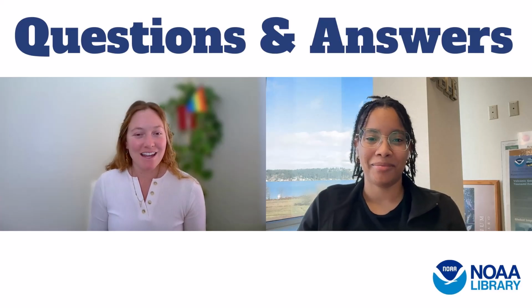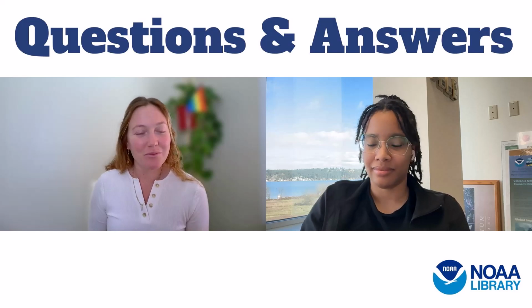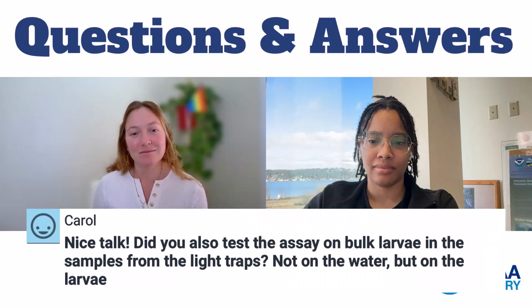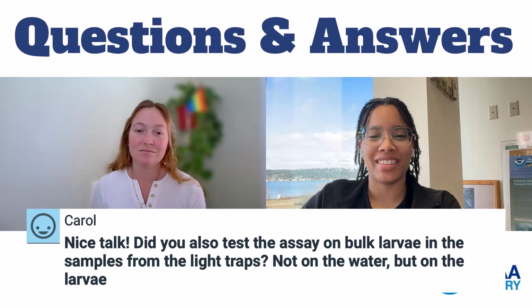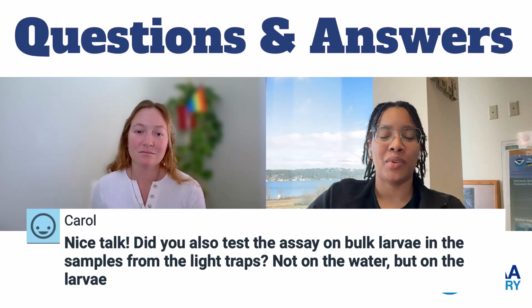I think that's it. I'm not seeing any more questions. We have one question. I think it's just a clarification of the earlier question. They were specifically saying not on the water, but on the larvae. Oh, we did not test specifically on the larvae itself. I think that's what Sean was mentioning about our plankton smoothies. We have not made plankton smoothies of our larvae. We did mostly just the water itself or the ethanol we removed from those samples.